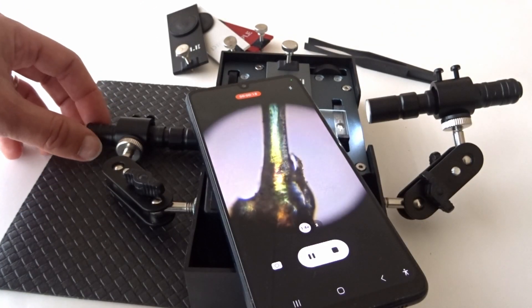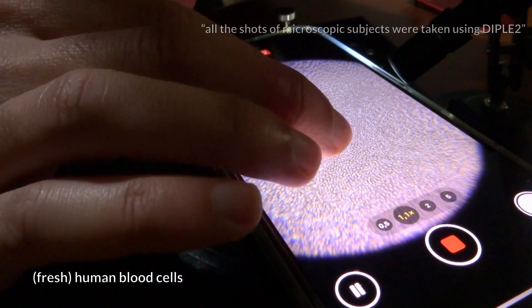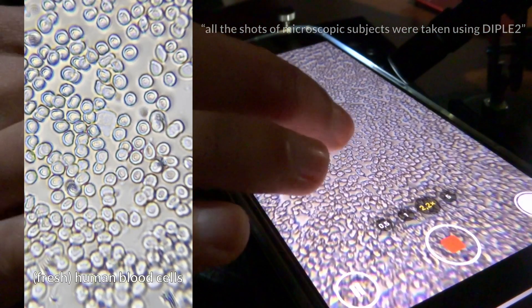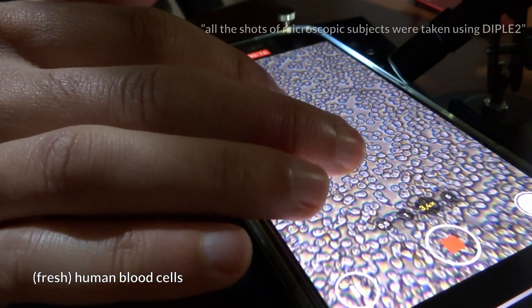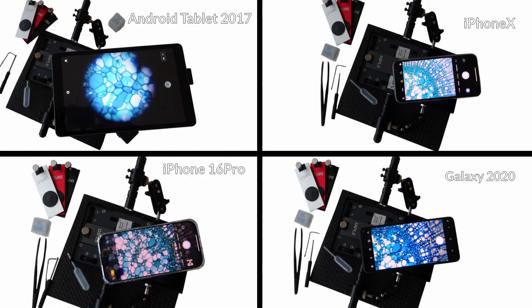See the microscopic world in a new light. Perform microscopy like a pro with Dipple 2. Dipple 2 is extra-powerful with optical resolution down to 700 nanometers, compatible with any smartphone.